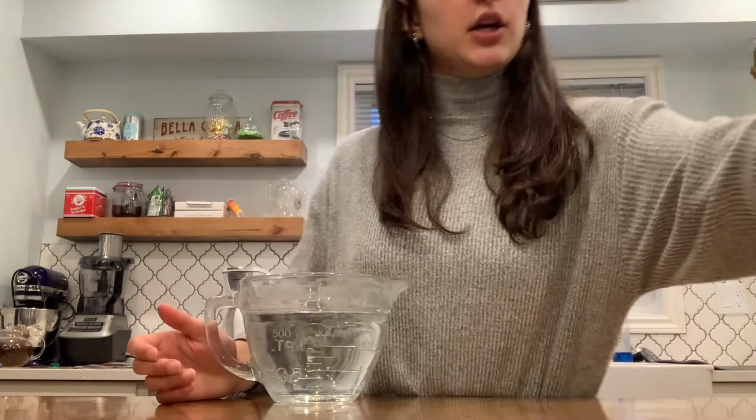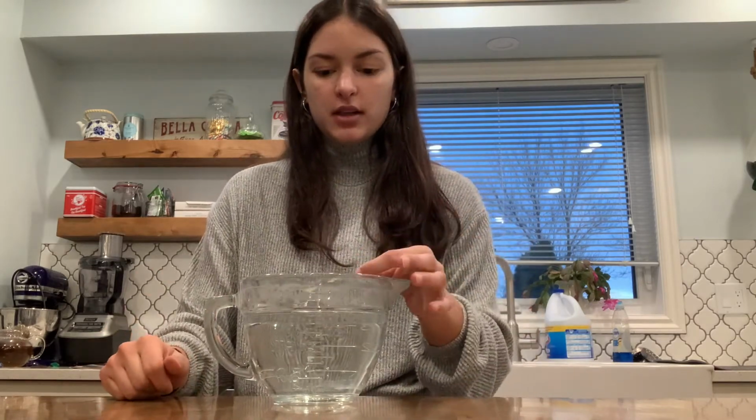So for our extraction experiment here, we have our separatory funnel, which in real life would be a cone-like shaped funnel that is sealed, but this measuring glass will have to work for this. We have some water inside of here, which is meant to act as our solvent. And then we have here the component that we want to remove, which is flavors from this bay leaf here. You may have seen bay leaves used in cooking for soups and stuff. Usually you put the bay leaf into the soup and leave it there to cook with the soup, but then you typically don't eat the bay leaf. It's just meant to give extra flavor to it. And then I have some added food coloring on here just to demonstrate the flavors that would be extracted from it. So I'm just gonna place it right in here.